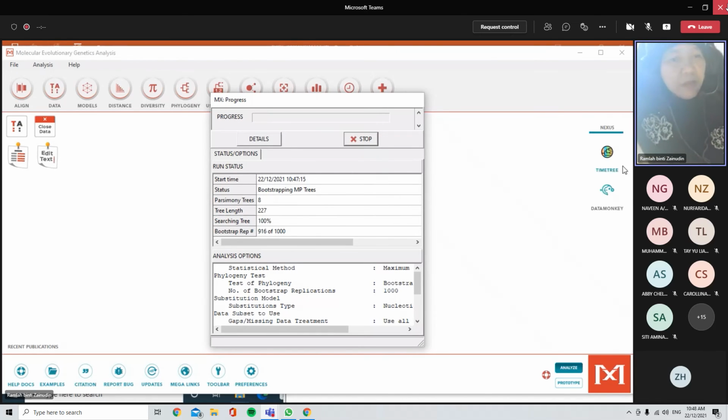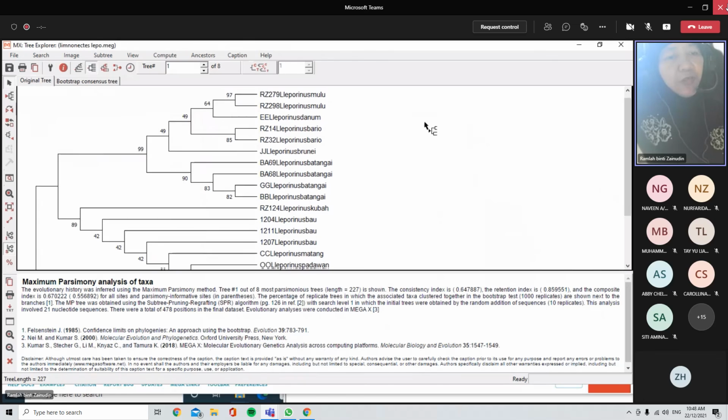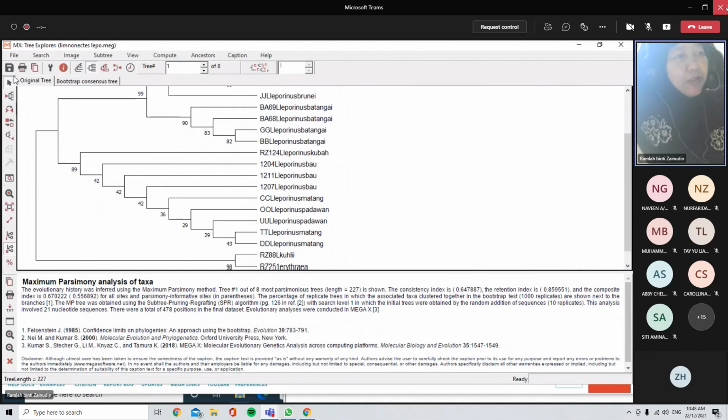Okay. So you nampak sampai dia sikit lagi ya. So you can see masa saya when you get to have so many trees for this particular analysis. Jadi sikit lagi tambah kita akan, saya dah cakap kita akan start at 11:15 today. Okay, finish. So dia akan keluar. So this is a parsimony tree. So you look, dia punya ni memang nampak. Okay, this is only one tree. Tengok sini ya.